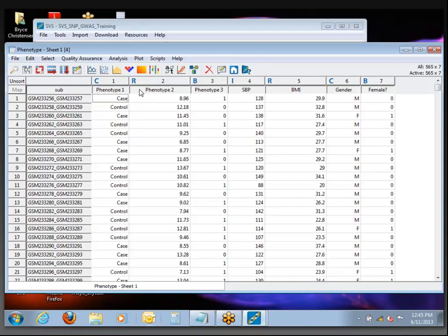Now, what I want to focus on right now is how you would go about editing any data.